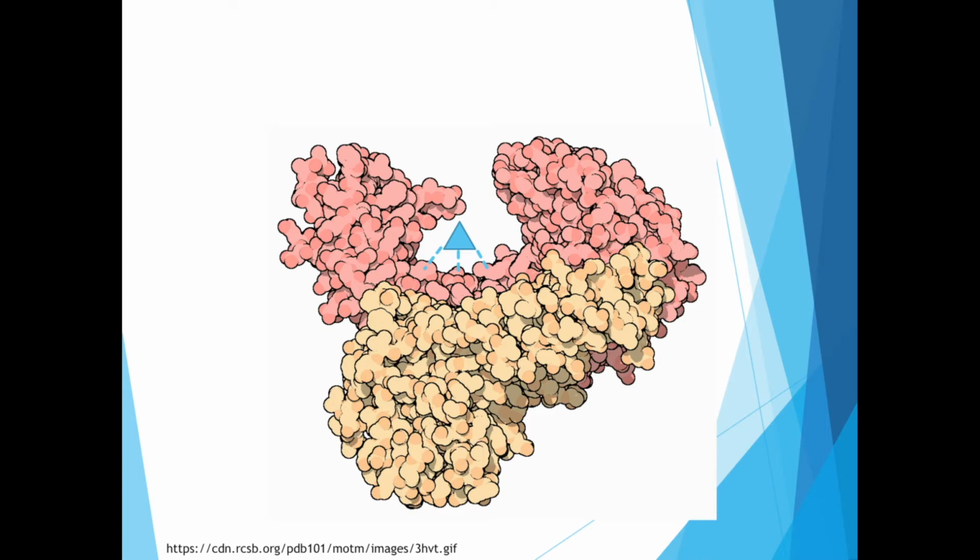Drug binding is a process where chemical bonds are formed and will cause chemical shift, which can be well measured using NMR. A group of researchers from Thailand and Japan tried to use NMR to find a metric that measures HIV drugs' effectiveness. They labeled important amino acids on the reverse transcriptase with carbon 13, which makes those amino acids identifiable on the NMR spectrum.